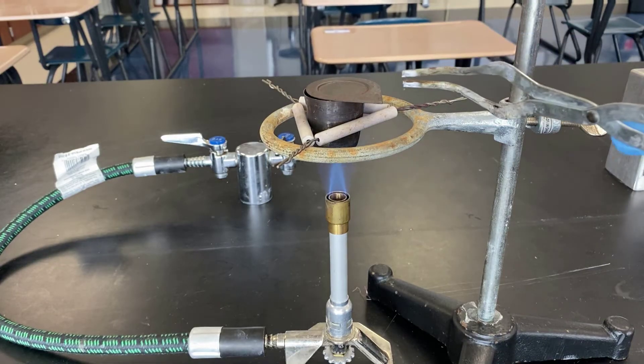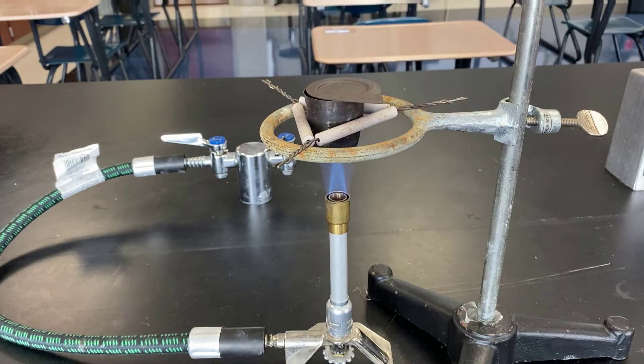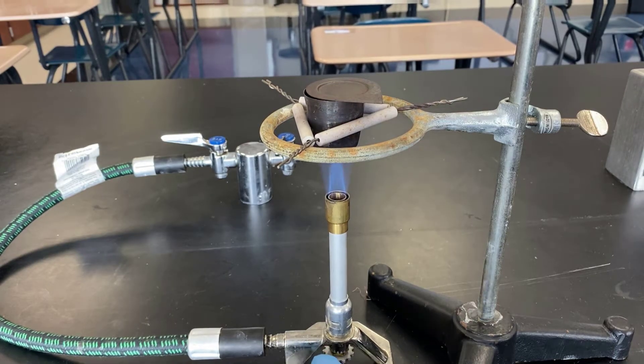As the heat hit the crucible, you may have noticed that some condensation appeared to evaporate and go away. While it might be minimal, remember that water is on the crucible and it's now gone.